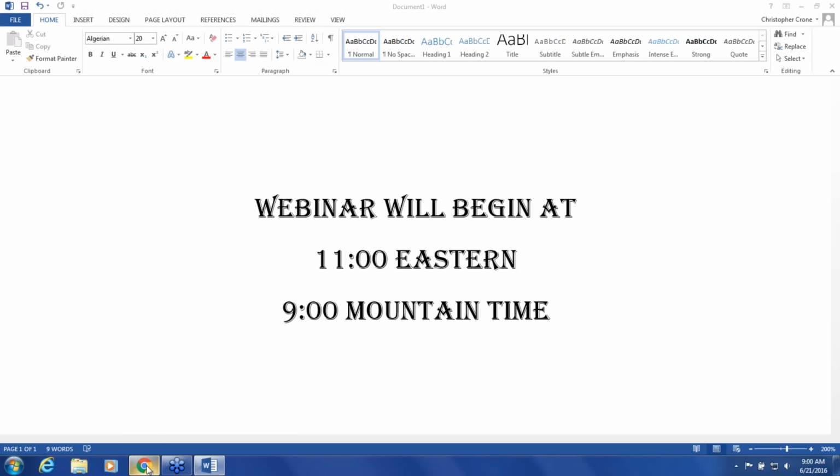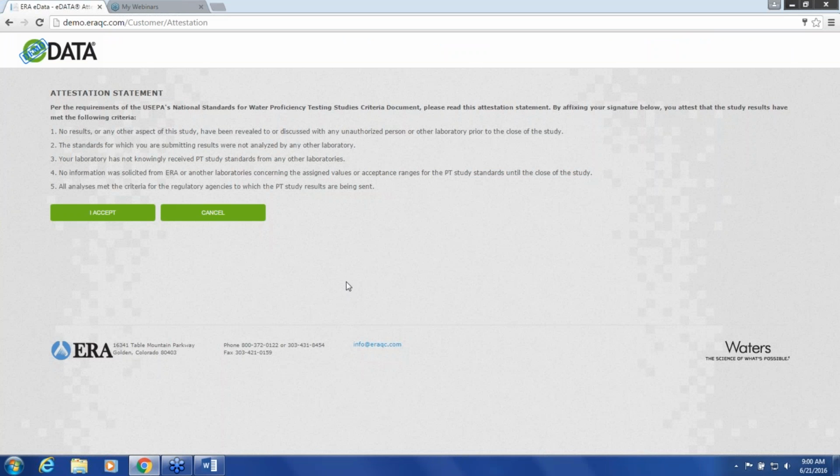Good morning. Welcome to the next webinar in eRA's ongoing series of webinars. Today, we will talk about using performance analysis tools in eDATA for multi-laboratory networks. This talk is targeted to QA managers for laboratory networks.